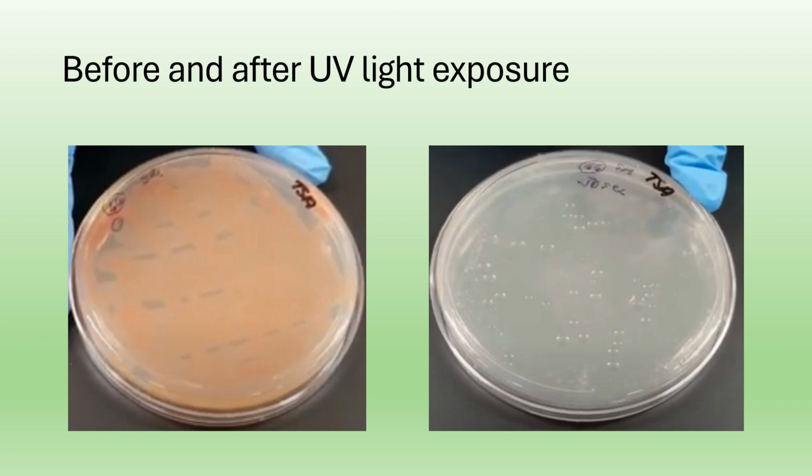But as I said, there's that timing in the middle, between not causing damage and death, where it can cause mutations. So this is an experiment where we test that theory out.